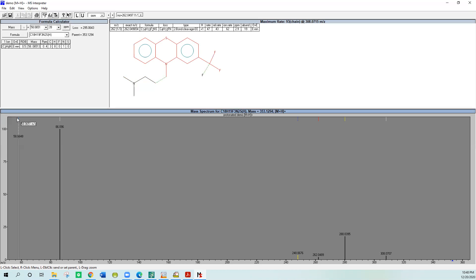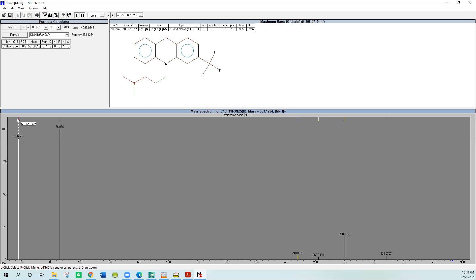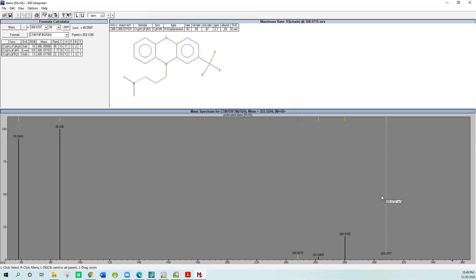You could keep stepping through them. There were actually three structures for that. Three of three, and then it jumps over to the next ion. You could just keep stepping through the whole spectrum until you get to the molecular ion, which is absent in this spectrum. It gets as close as the 308, but it's very easy to use. It's not much of a problem.